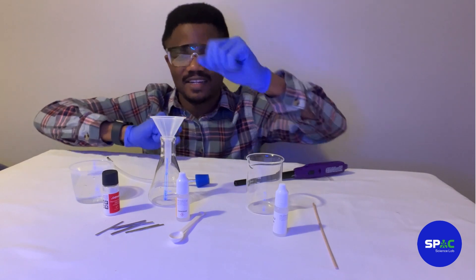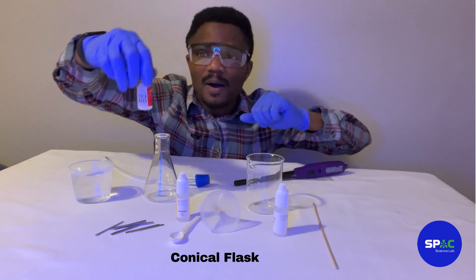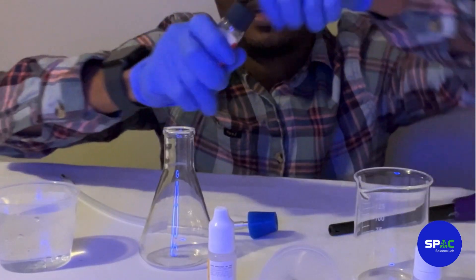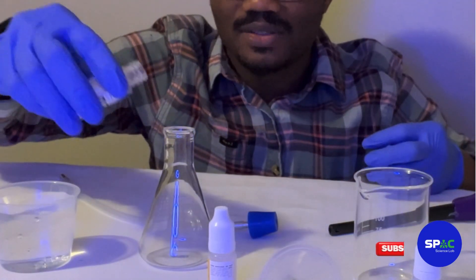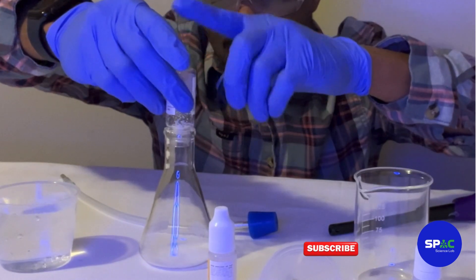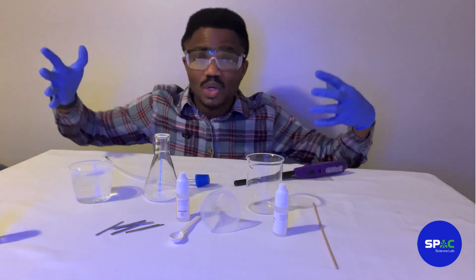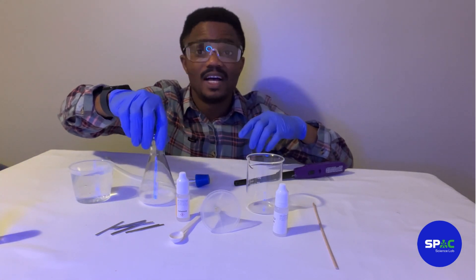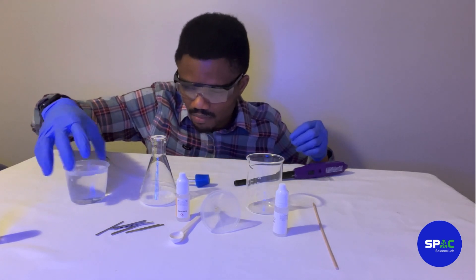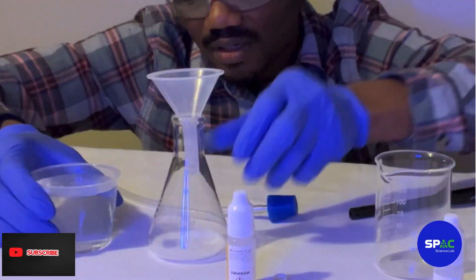Let's get started. We have our beaker, and we are going to pour the sodium hydrogen sulfate into it. We then need to dissolve it, so we're going to pour about 100 milliliters of water in here using our funnel.